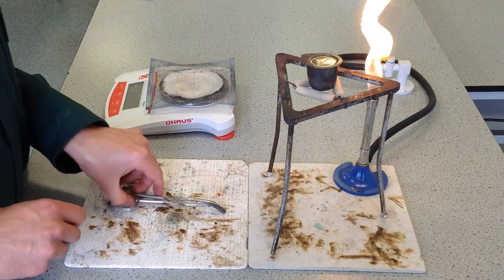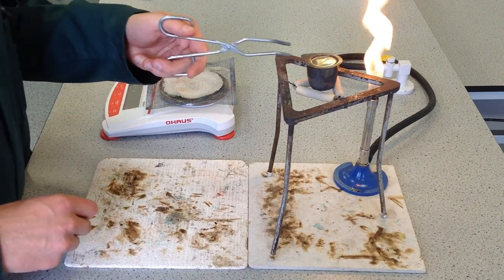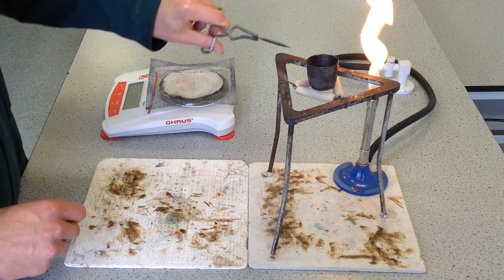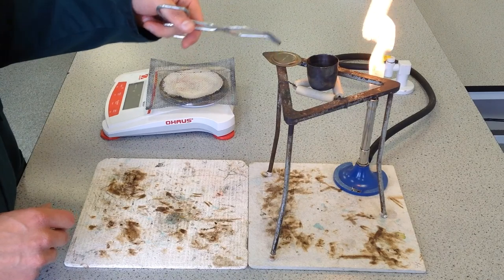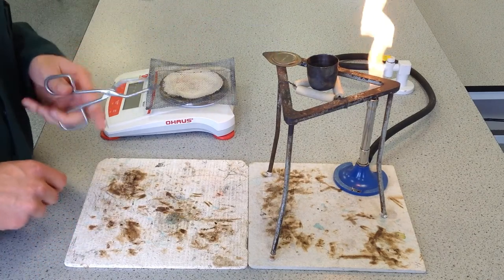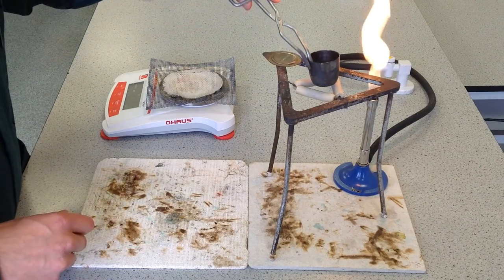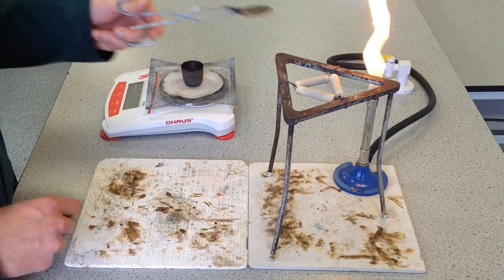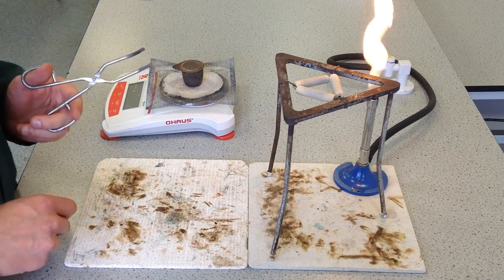If you've only got the simple tongs, you lift the lid and place it either on the balance or on a heatproof mat with the underside of the lid facing upwards, because you might have some material on there that you need to weigh. Then transfer the crucible by itself, holding onto it by the corner, place it on the balance, and then place the lid on the balance also.